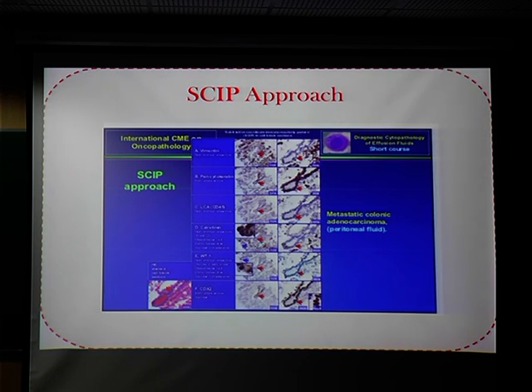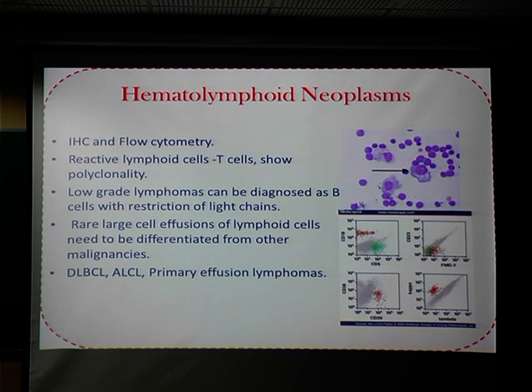But provided you have the same group on which all the markers have been applied. And this needs lots of effort, because once your slide is exhausted and you are taking the section on a newer slide, again you have to keep track of that particular section. So it is the serial section and identification of the serial section which is very important.